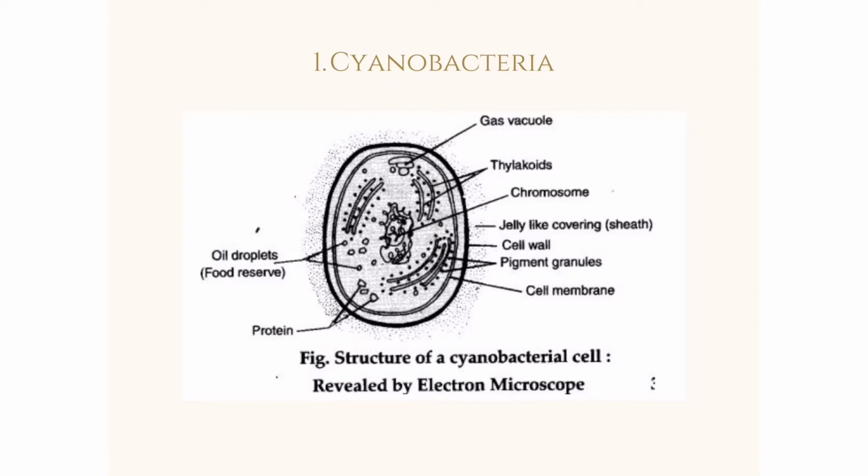The cytoplasm has pigmented lamellae around its periphery derived from the plasma membrane. The nucleoplasm, where the DNA is located, is made up of lots of thread-like fibers or filaments and is in the center of the cell. There is no nuclear boundary or nucleus. The nucleoplasmic material, scattered throughout the cell, splits in two during the cell division process.